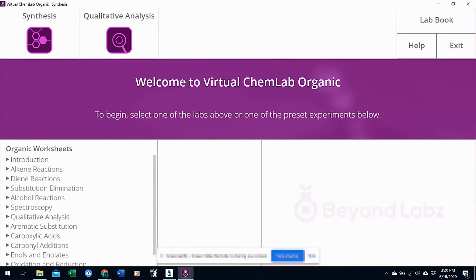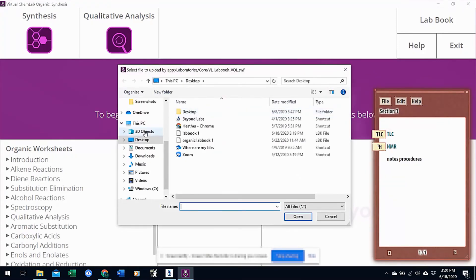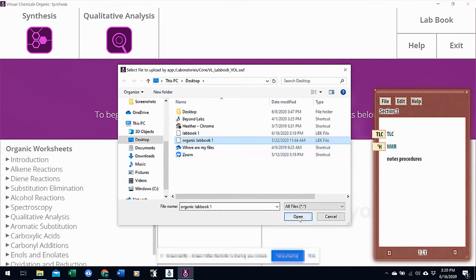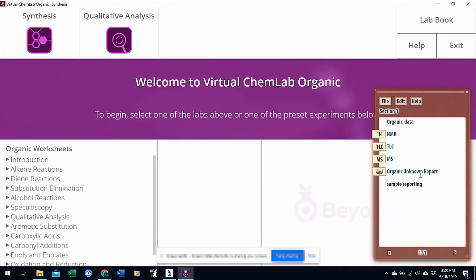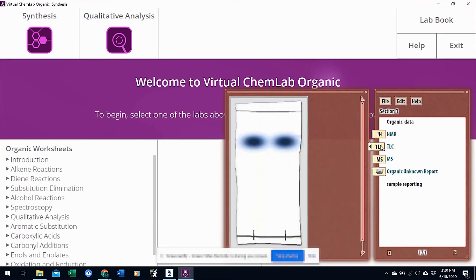What your instructor will do is open Organic, or whatever lab you're saving it from. They'll click on the lab book and click File, Open File. They'll be able to open any lab book files that have been sent to them. So if this is another student's file and they open that one, they would see all of the data from that student and could view everything they need.